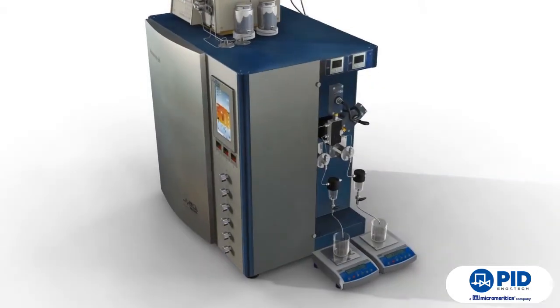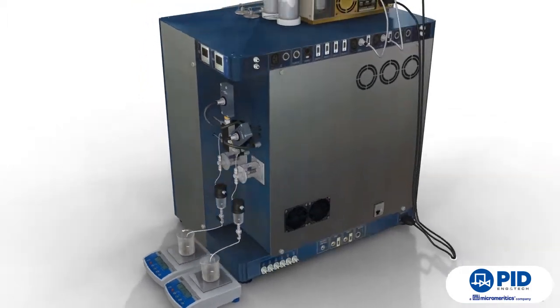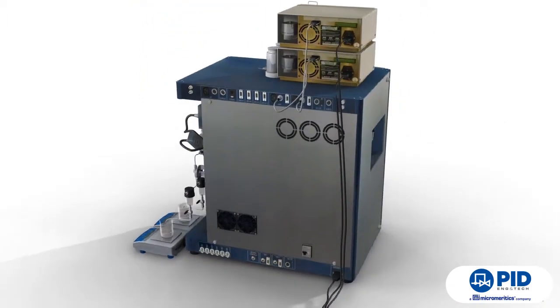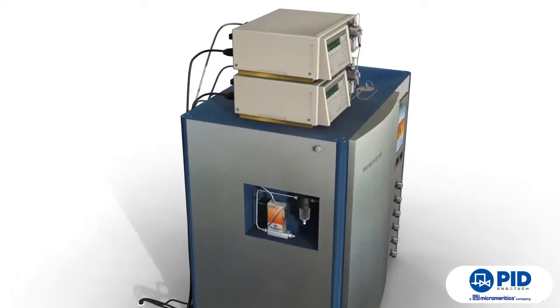In order to solve this difficulty and achieve reliable and accurate results, we have created the L2 separator as the perfect tool for Fischer-Tropsch or other reactions in which two liquid phases are obtained.